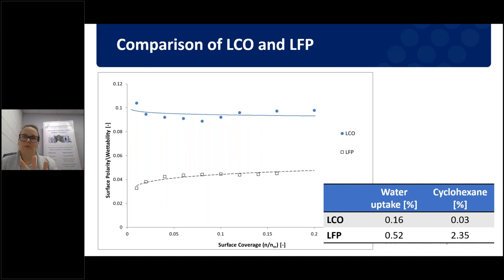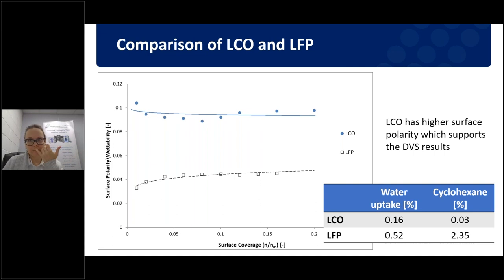This is what we also saw in the DVS results, that LFP shows better sorption behavior with cyclohexane compared with the LCO, which seems to have higher water uptake than cyclohexane. So this supports the data we got with the DVS.